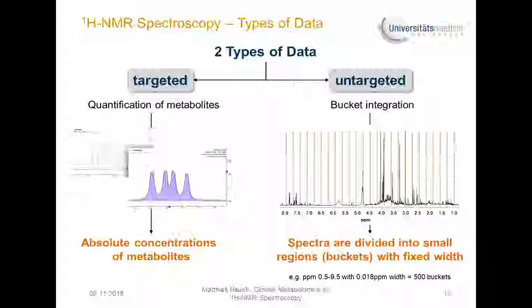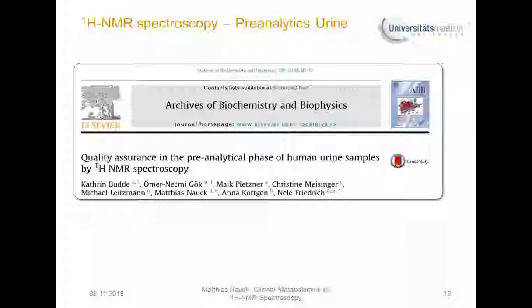In this approach, we divide the spectra into small regions, which are called buckets, with a fixed width. And then we look at these buckets and look if there are any associations between the buckets and the height of the buckets in view of some associations to clinical aspects.